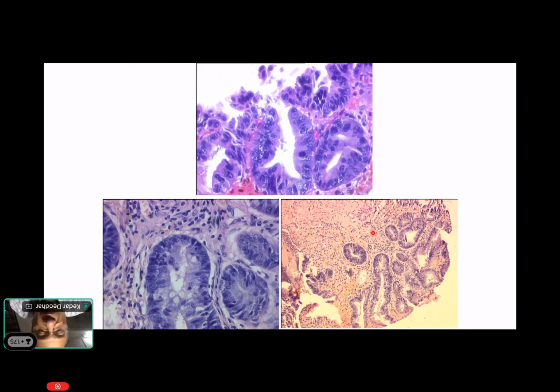This can extend into the sinuses. Whether they constitute an adenocarcinoma diagnosis or not is a difficult matter. Generous sampling and assessment of fibrous reaction will tell us that. And that, indeed, I confess, is a very difficult diagnosis. That's why we are fortunate to have a large department. This is where the experience of our colleagues or informal consultation before I give a diagnosis is actually very important. Low grade and high grade dysplasia have stratification, and along with that we have a loss of polarity and atypical mitotic figures. I think I'll go ahead.